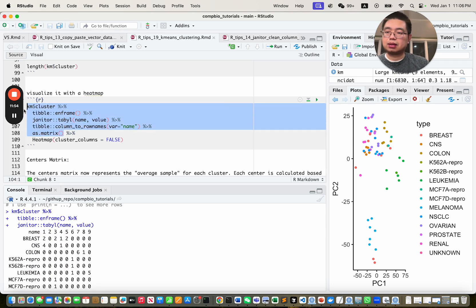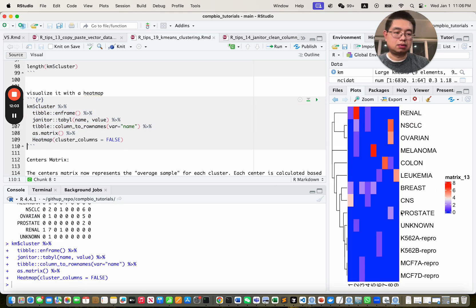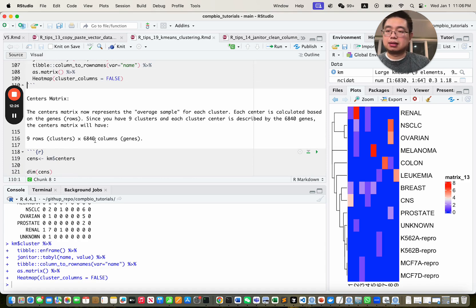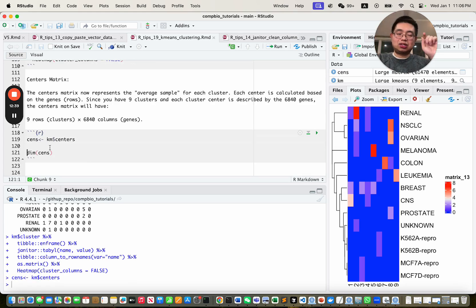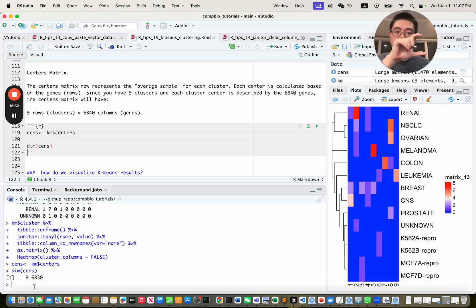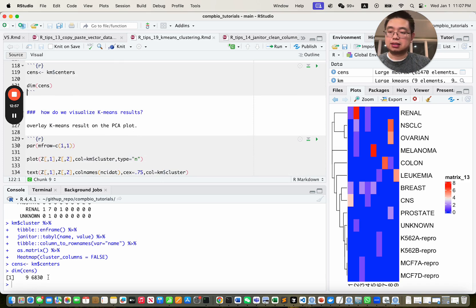Turn the table into a matrix and use the heatmap function from ComplexHeatmap. The cluster ID is one axis, cancer types are the other, and the number shows how many samples of that cancer type fall into each cluster. For example, cluster two contains mainly renal cancers. There is also another output from k-means: the centers. Save it as a new variable — dimension is nine rows (clusters) by 6,800 columns (genes).